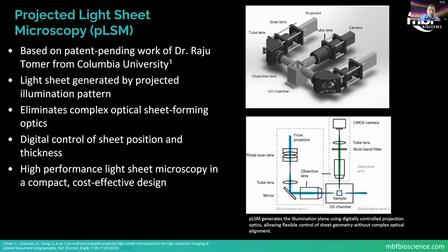So how do we simplify light sheet microscopy while still maintaining high performance? The key really is this concept of projected light sheet microscopy, or PLSM.